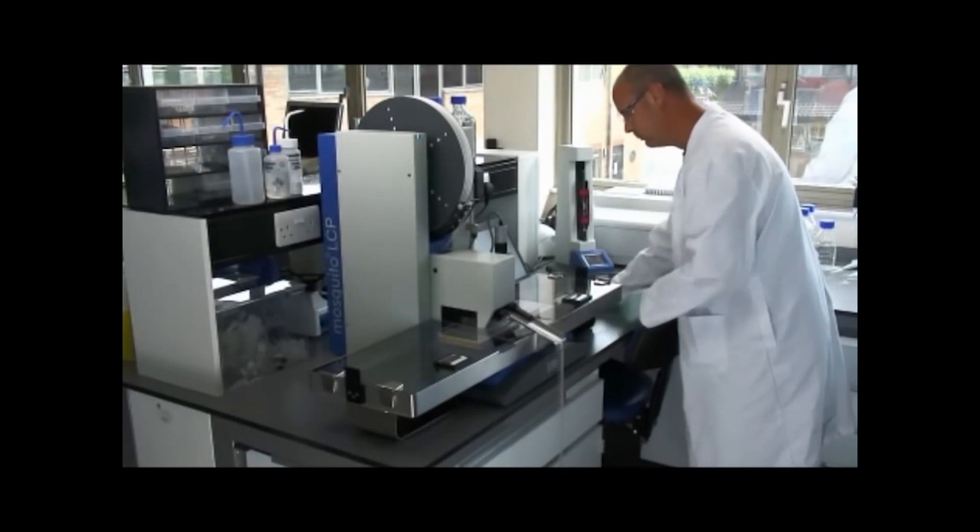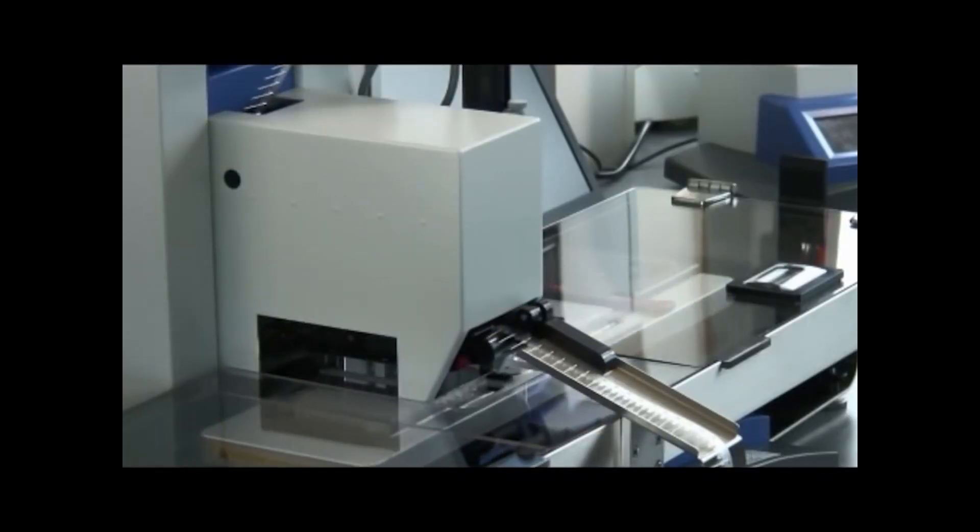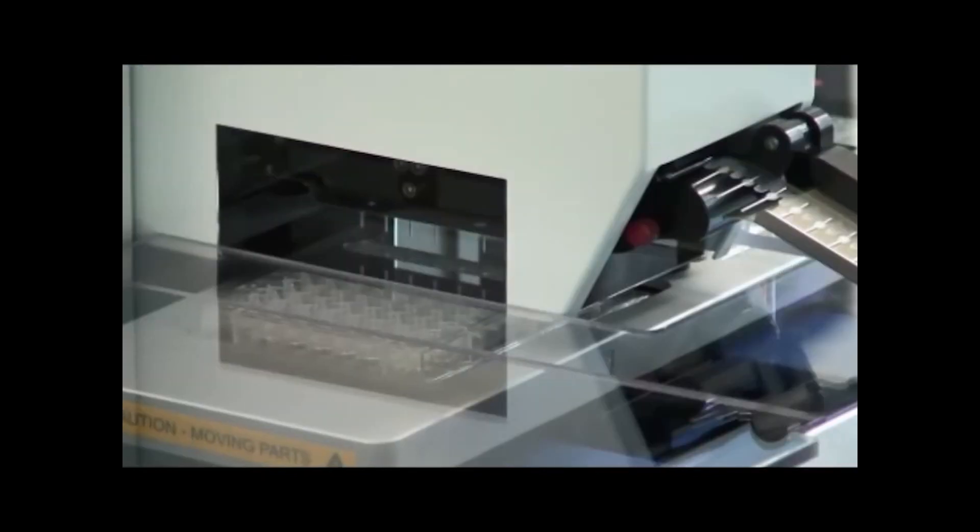Mosquito LCP is an extremely fast, robust, and simple-to-use instrument that automates what was previously an extremely difficult process.